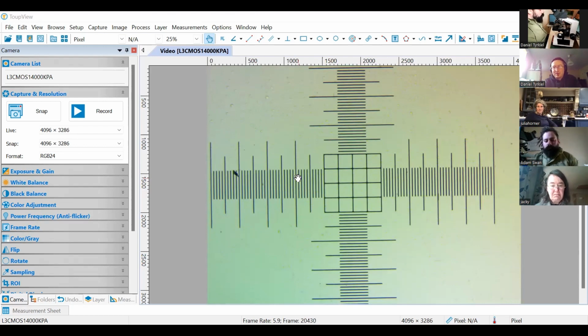But what Adam basically is showing you is that you can use it for two things. You can, first of all, get an idea how wide is your field of view. Now, when you buy a microscope, the person selling you the microscope or the person training on the microscope will tell you what it is. So with this microscope with a 10 by 18 ocular and 40 times magnification objective, the width of that circle that you can't see, because you're just seeing a cutout from that circle, is 450 micron, which is just under 0.5 millimeter.